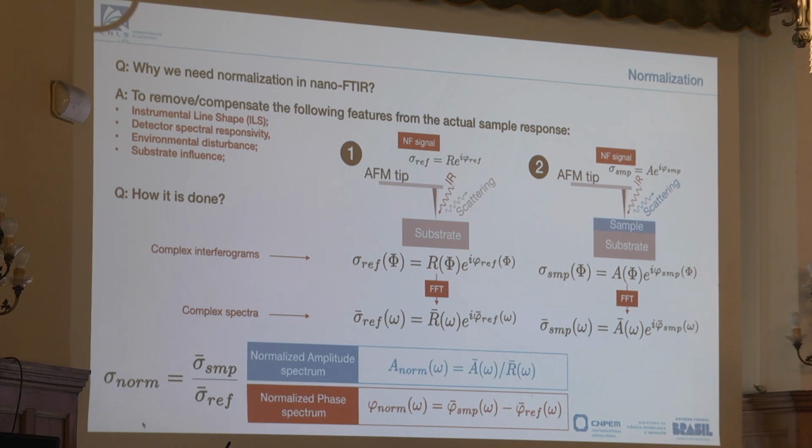So now we have a phase contrast with respect to the substrate. That's an important point that was stressed yesterday, right? To talk about phase, there is no sense in talking about just phase, but we need to talk about phase shifts, phase contrasts, phase delays. It's always related to something.